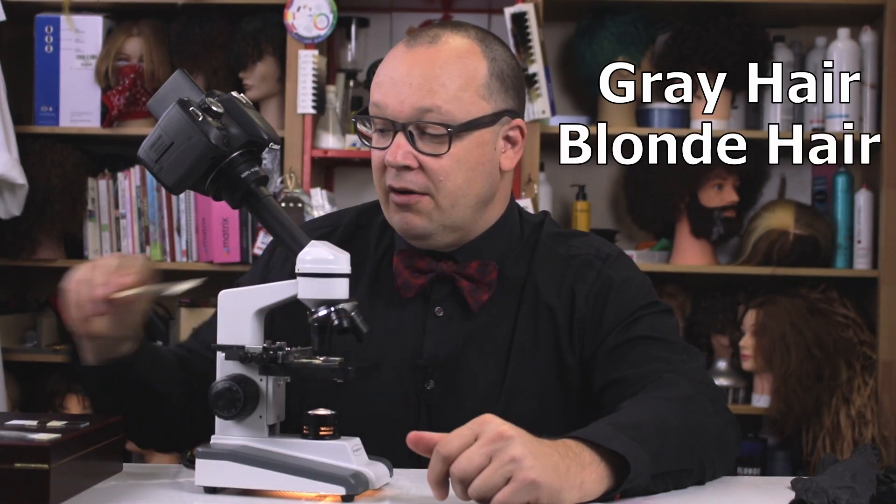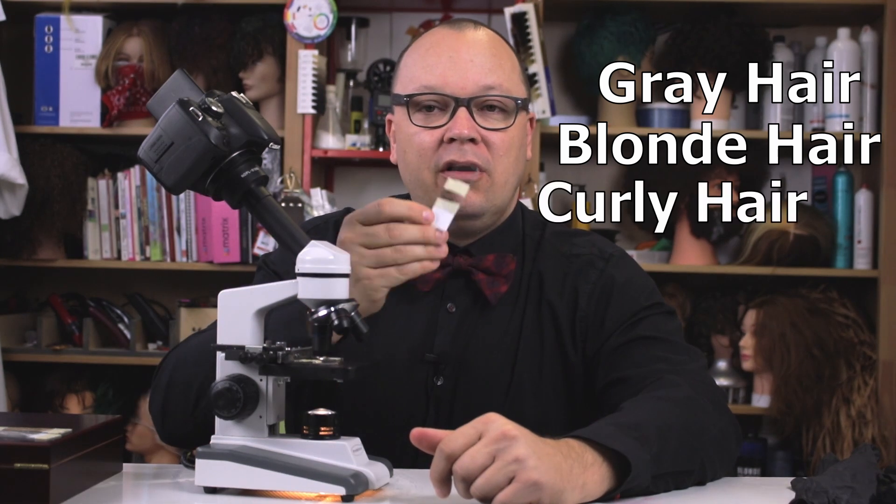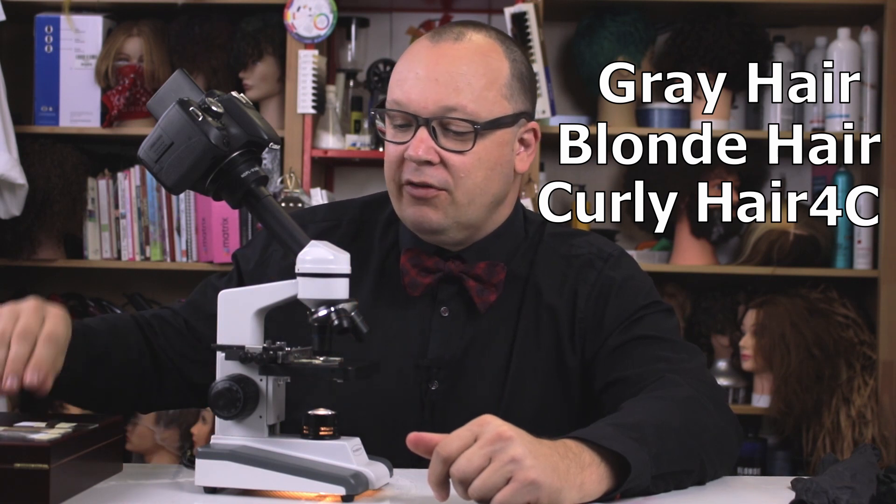A while back I did some hair under a microscope and asked for requests of what kind of hair other people would like to see. I have a couple of those requests today. We're going to see some different textures, some different colors. I have four types of hair: some natural gray hair, some naturally blonde hair, some highly textured — what could be called 4B or 4C hair, very tight curls — and some chemically relaxed hair.